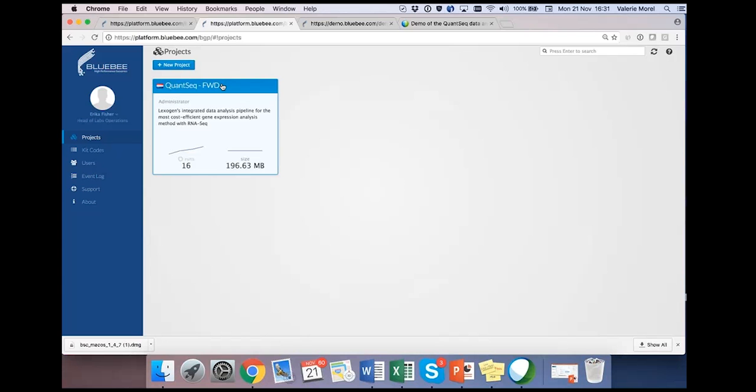So the annotation is very condensed and does not have as many different isoforms as Ensembl. And usually the 3' UTR is also not as well annotated in RefSeq as in Ensembl. That's why we chose the Ensembl annotation.